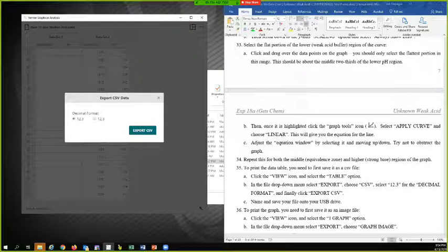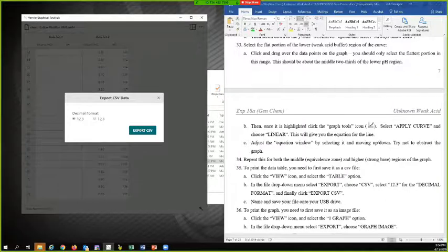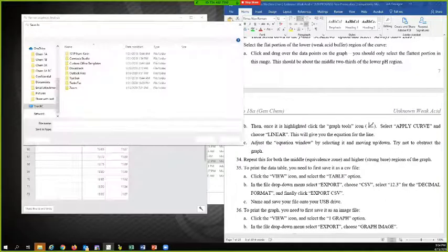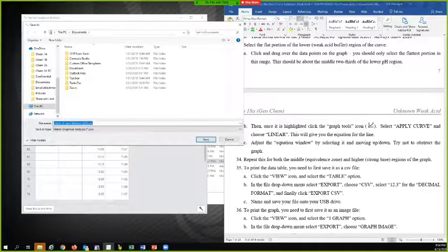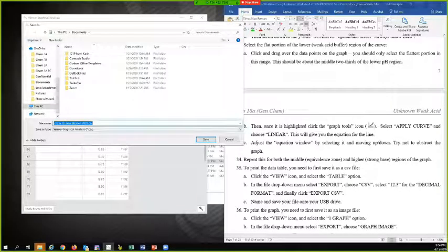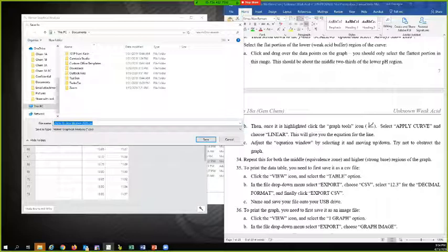And now it's got 12.3 or 12 comma 3. Because in Europe they use commas instead of decimal points. But we want this one. Export CSV.